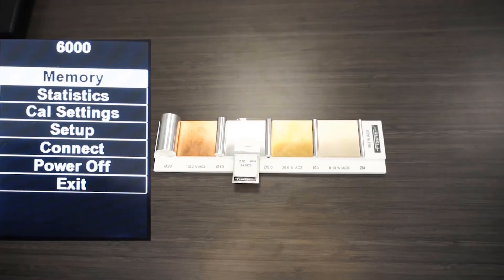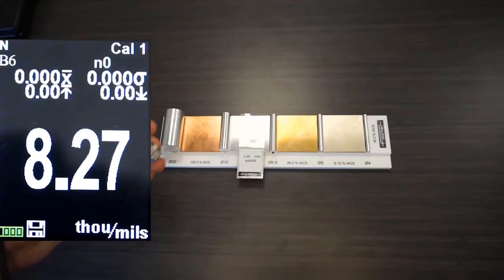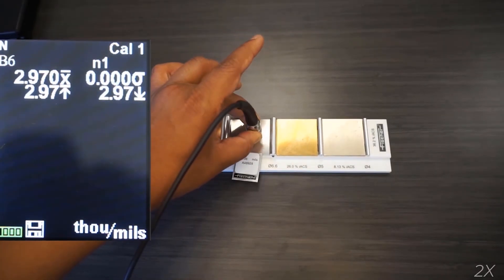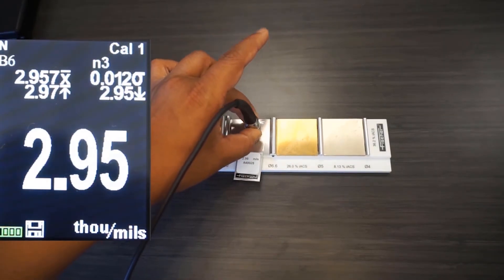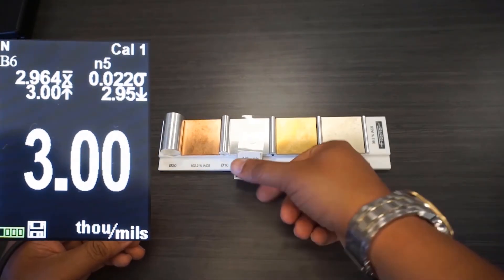Now after the calibration, I'll perform the same set of measurements as I did with the FMP40. It does pretty well on the flat substrate and it reads the foil back accurately.